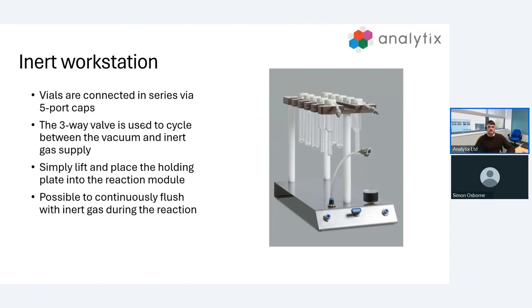After this we've proven that there's an inert atmosphere in all 10 vials. Then we can simply lift the top plate, that brown bit you can see with the vials hanging on, and that lifts off the base and fits directly into our reaction module. A lot of people like to keep their inert gas connected and throughout their reaction have nitrogen continuously flowing through all 10 vials. On the outlets that are connected to a gas bubbler, this way they can actually visualize that inert gas is continuously flowing through the vials and that we have an inert atmosphere.